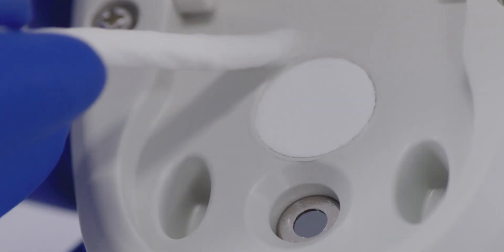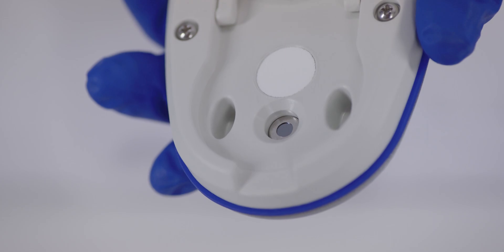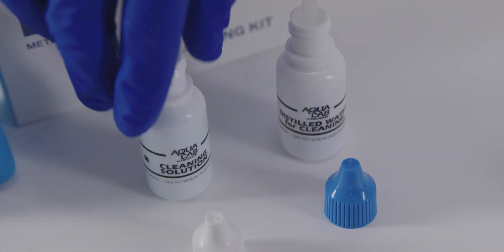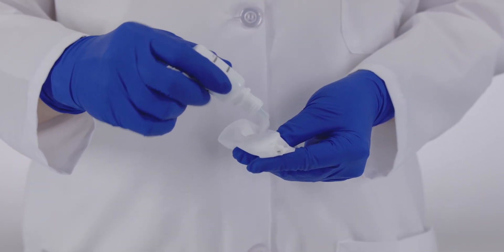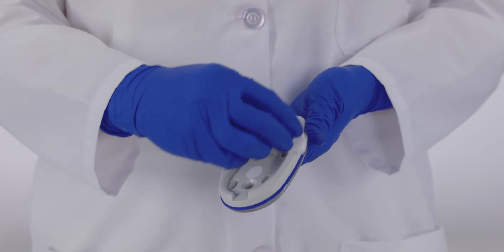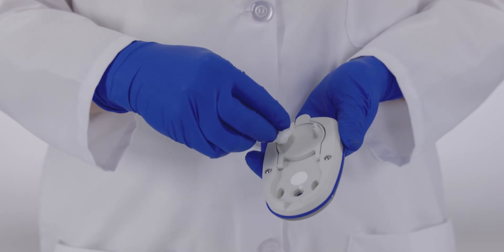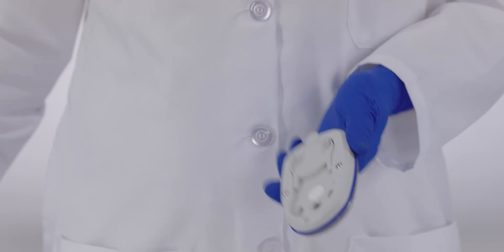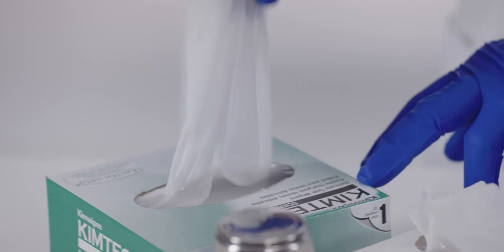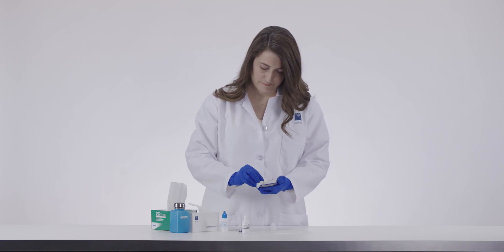Note the location of the white filter that covers the capacitance sensor. This filter cannot be cleaned and should not be touched during the cleaning procedure. Later, we will show how to change the filter if it becomes contaminated. To clean the rest of the sample chamber, moisten a large chem wipe with isopropyl alcohol or cleaning solution and wipe down the surface areas of the sample chamber. Be very careful not to touch the white capacitance filter. You can use any concentration of isopropyl alcohol greater than 90%. Change chem wipes frequently, even if they appear clean. If the chem wipe appears dirty after cleaning, get a new chem wipe and repeat the cleaning process.